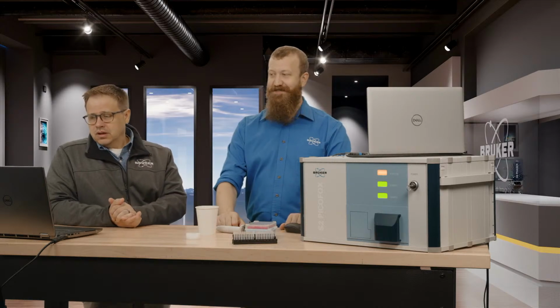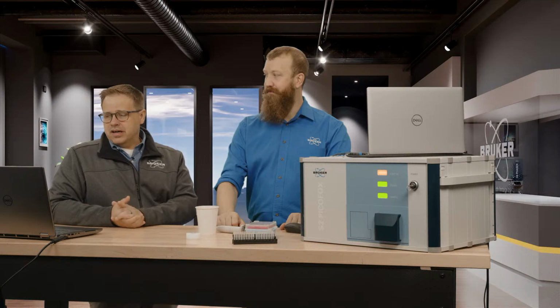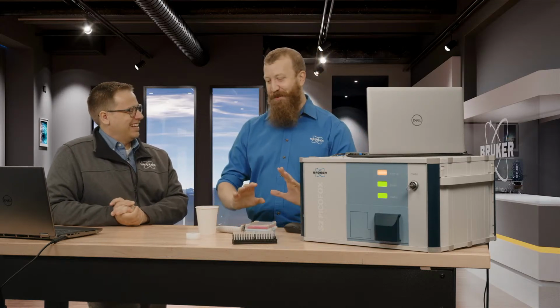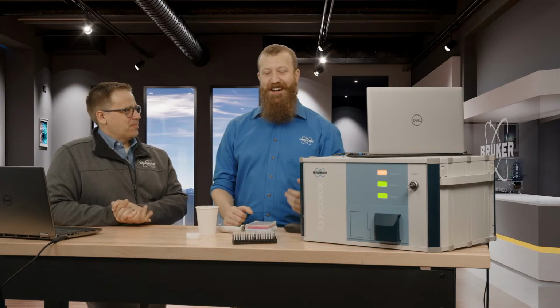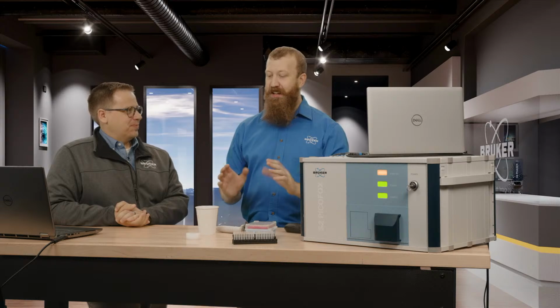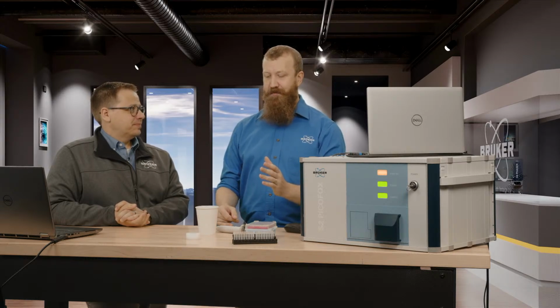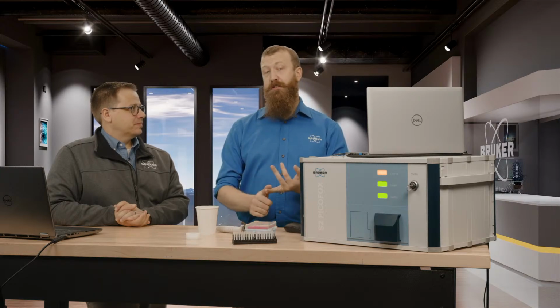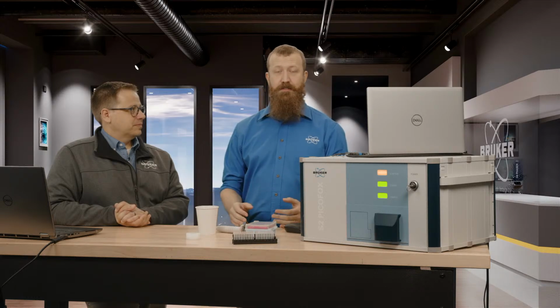Yeah, exactly. All right, Joanna had written, how can you achieve the best possible results? That is a big question. That question's given a couple hours of time during training. But the broadest possible way I can say is that as long as your sample is homogeneous, and as long as your sample makes a nice smooth film, that's going to give you the best results.